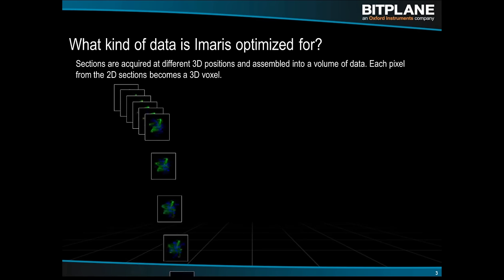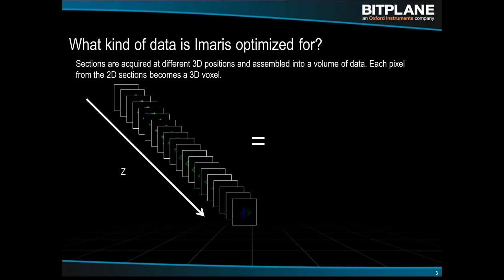It's a volume element. And those individual planes, each one through one method or another, is able to restrict the acquired image data to only a particular plane of focus or some spatial plane by another method if it's not based on focus. And then we know the exact position where the imaging system was focused when that image was acquired, and so we have some depth data about each pixel in space, and we can assemble those into a stack of pixels that gives us our volume image with now voxels in it.